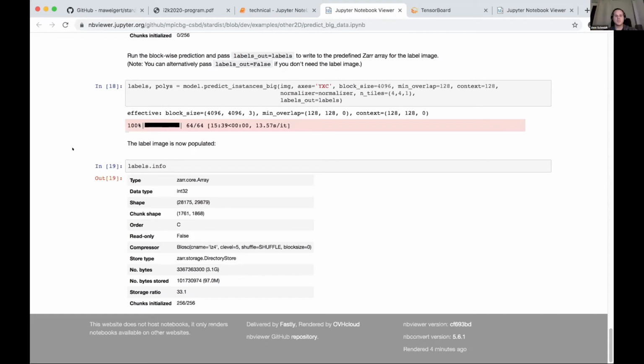And some people have a more sophisticated approach where they freeze some of the layers of the pre-trained network and keep other layers unfrozen to retrain on the new annotated data set. So are all these approaches possible within your framework, and which one would you recommend for the kind of usage I have described?